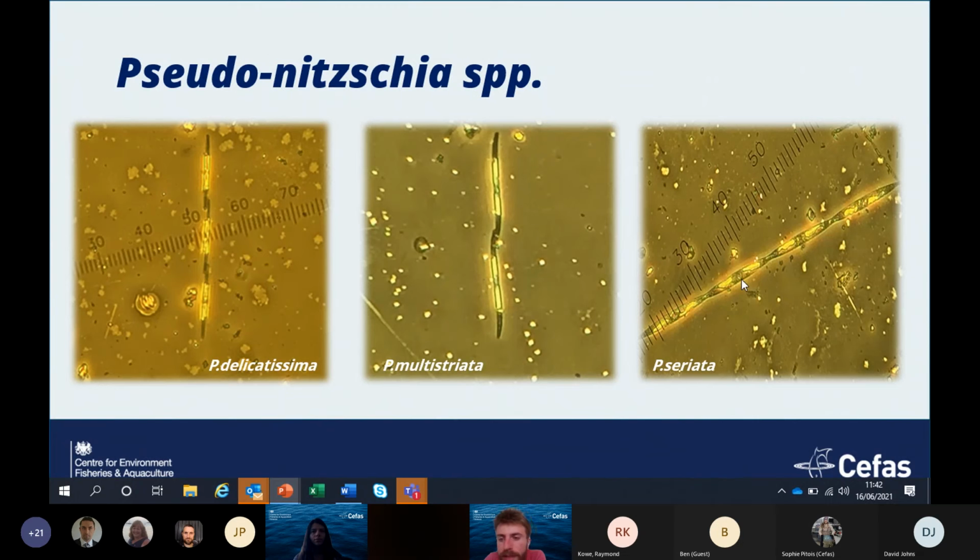And I've got a bit of video later. Unfortunately, it's only very, very short, but you'll see there's a chain of Pseudonitzschia seriata in the video, and then some other thin chains of diatoms, which you could easily mistake for Pseudonitzschia. So you have to be rather careful when you're looking for these.